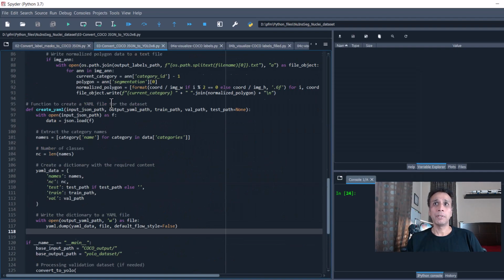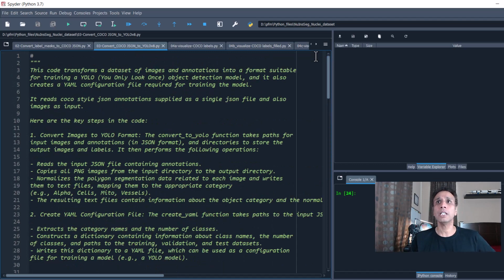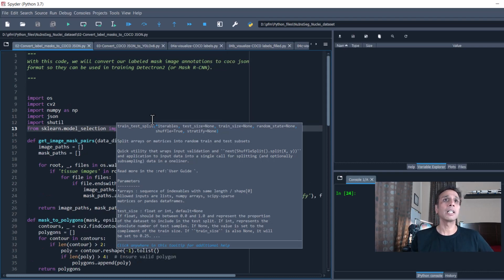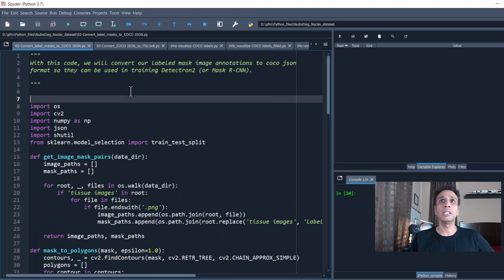What is the next step? Next step is, let's zoom in. I should be a bit more prepared, but that's okay. Zooming in is easy. I added a whole bunch of text. Oh, sorry. First thing first, we should do this step first. Oh, God. Okay, my keyboard is underneath and it's unreachable.